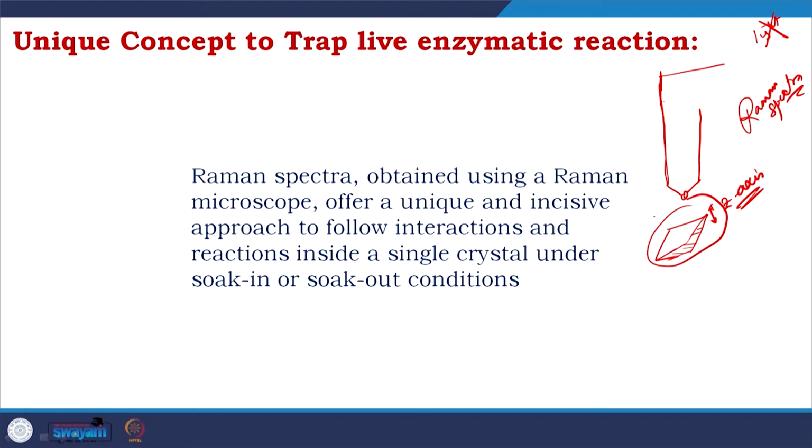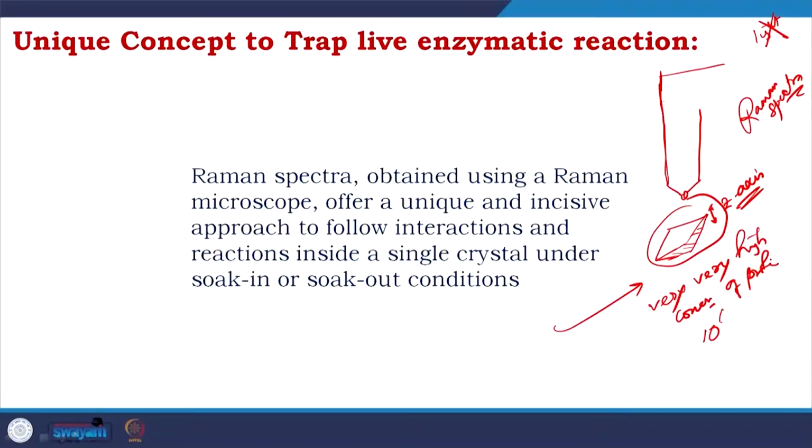What is the advantage? First advantage is very high concentration of protein, right. If you compare a solution of protein and the same protein in a crystal, you get at least 10 to the power 6 to 10 to the power 10 times enhancement. That is the first advantage.